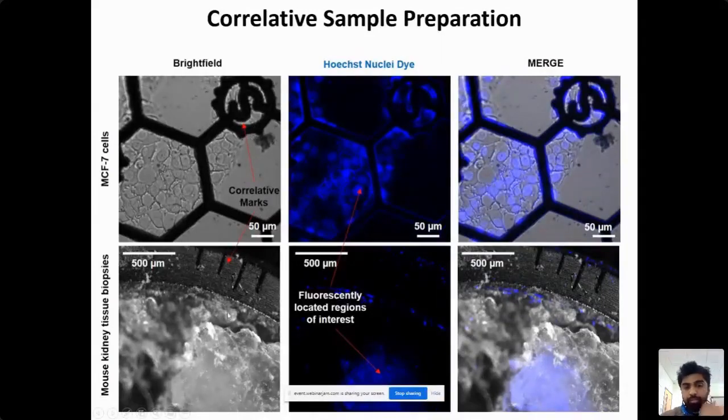And to make sure I'm able to adapt it to the current system, I custom make my marks. So basically what you're looking at here is using a scalpel or a metal pen, I just make these marks on the corners of these planchettes before sandwiching them with the sample, which are also fluorescent. And then, as you can see, we'd be able to relocate these areas under electron or in fluorescence, as well as in ion imaging platforms.